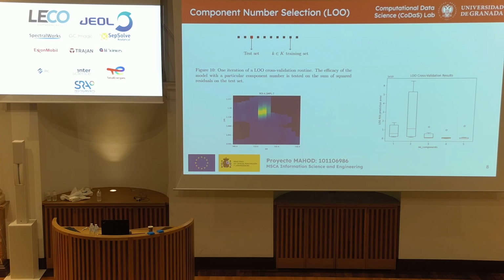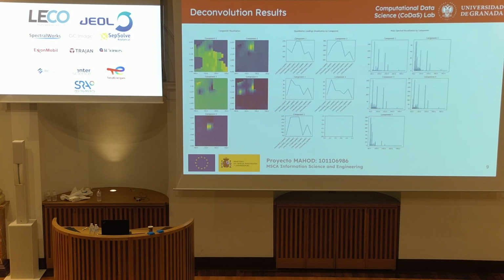We're not using all of the information. Obviously, you can do some sort of ANOVA-type analysis to see which component numbers are significantly different from each other. But just for simplicity, we're just going to go with this. And it does bias towards higher component numbers, obviously, but you can see that it does get you what you're looking for, in addition to some extra super fun stuff called the noise components, which you can sort of see like here, here, and here. So it's still very noisy, but for components 5 and 2, you get good mass spectra, and you get good quantitative results.